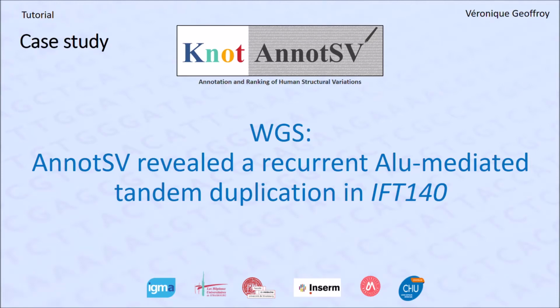Hello everybody. Today I'm happy to provide you with this case study entitled Whole Genome Sequencing. AnnotSV revealed a recurrent Alu mediated tandem duplication in IFT140.